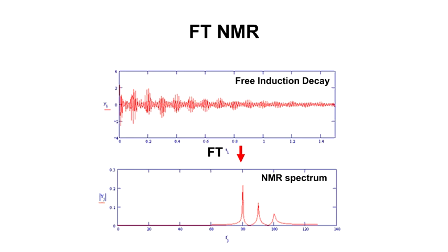So we're able to take, with Fourier transform, a signal that is exciting everything all at once, like listening to a crowded room, and then picking out all of the voices in that room, or ringing a whole bunch of bells and identifying which frequencies those bells are ringing at, or pressing all the keys on the piano and identifying which keys or notes were pressed. So that's the analogy with sound. This is done with radio waves. And this is an understandable spectrum.